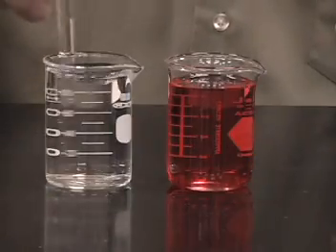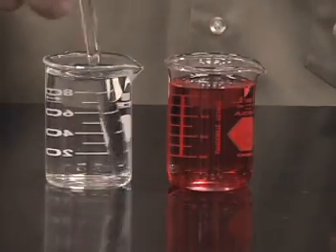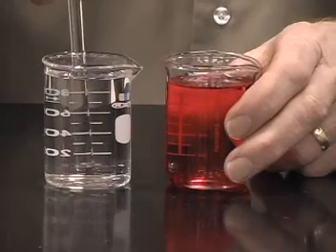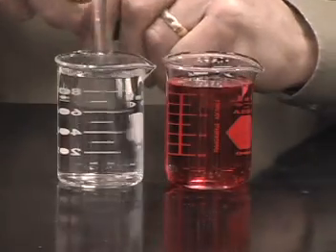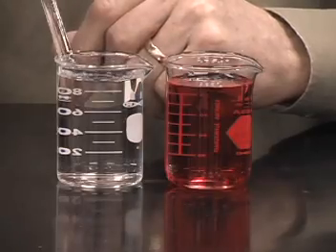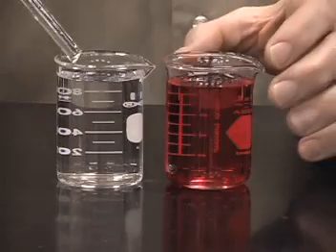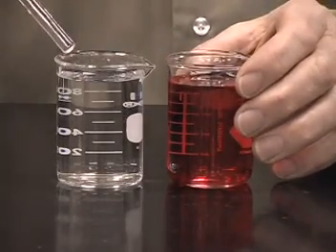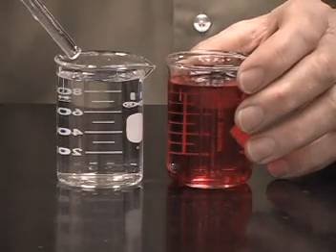We now have a concentration of 1 part per million. So I've taken 2 drops of the 1 part per 1,000 and diluted it by another factor of 1,000. You really can't see the color at all. And a part per million is a very small quantity. So small, in fact, that we cannot really detect it unless we have very sensitive instruments.